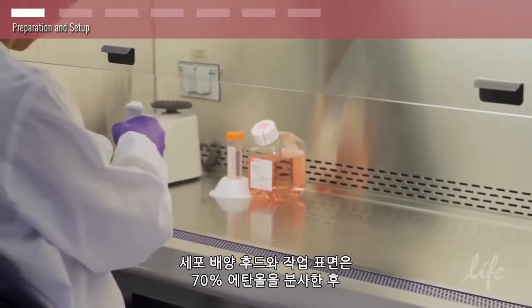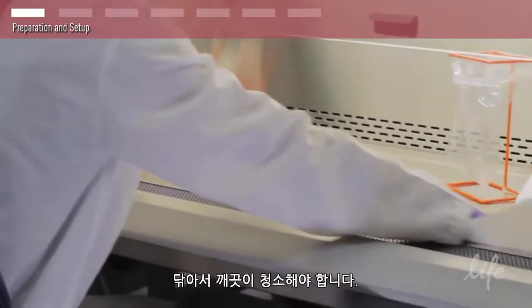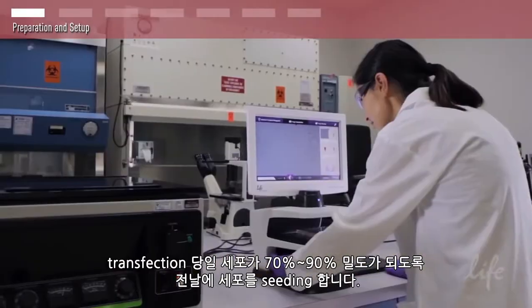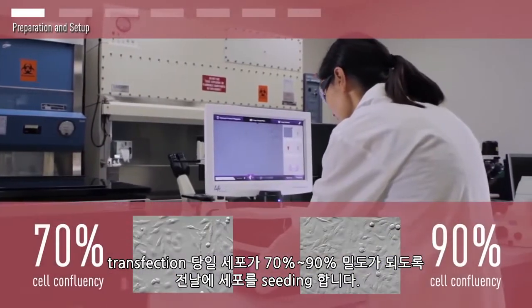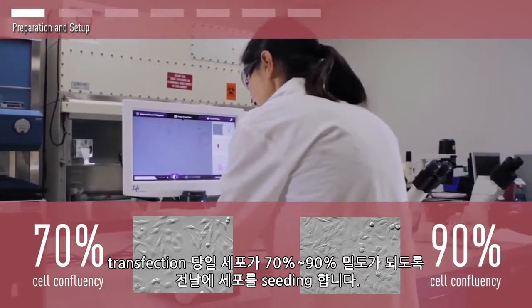Be sure to clean your cell culture hood and work surface by spraying and wiping them down with 70% ethanol. The day prior to your transfection, seed your cells so that they will be 70% to 90% confluent at the time of your experiment.